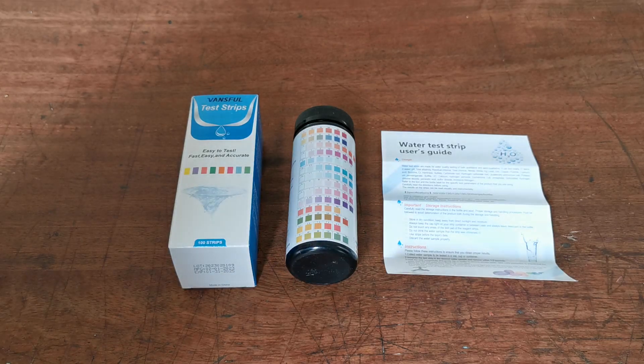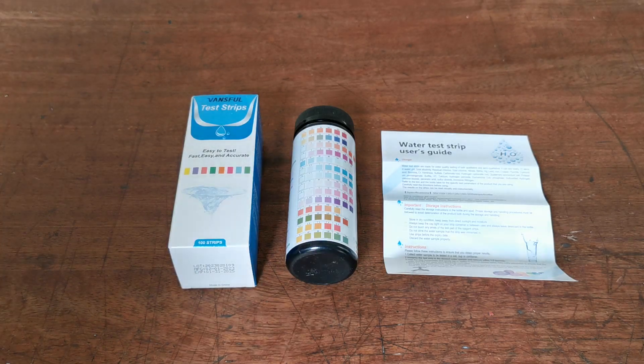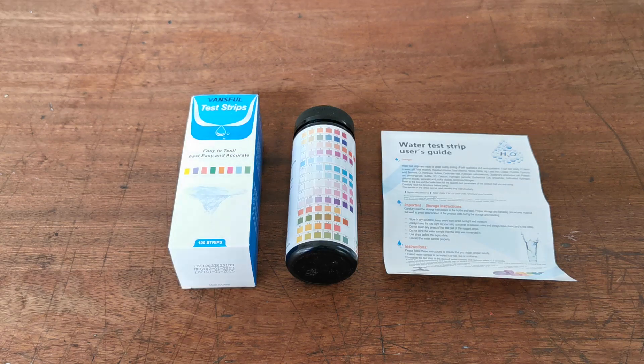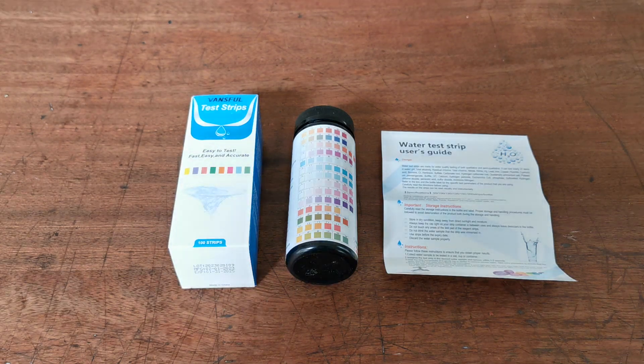As long as you put the lid tightly back on every time and don't store them in a moist environment, they will continue to function adequately for much longer than three months. Keeping them dry is absolutely key to extended life. Each pack contains 100 test strips, extremely good value at under 10 pence per test. You can test as often as you like, and they're ideal for monitoring swimming pool water or aquarium tanks.